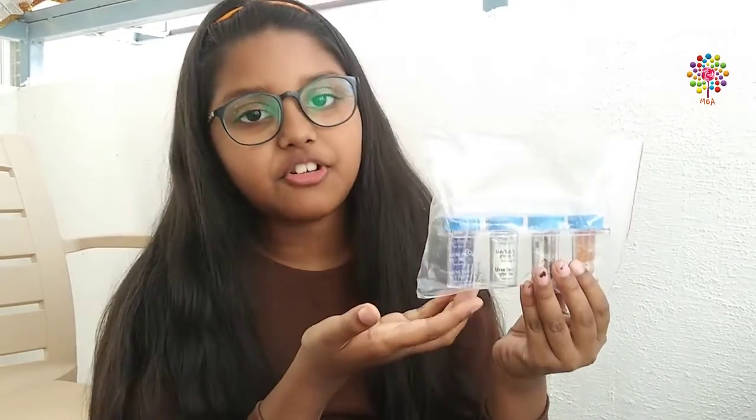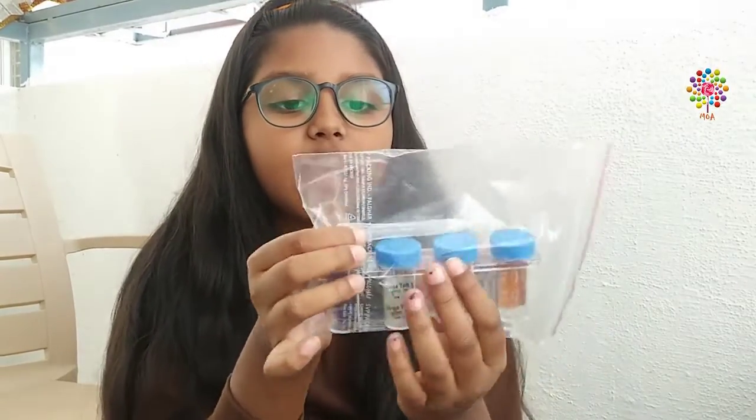We are going to check the purity of milk. Let's start. Things we need for this test are, of course, test tubes and a dropper.